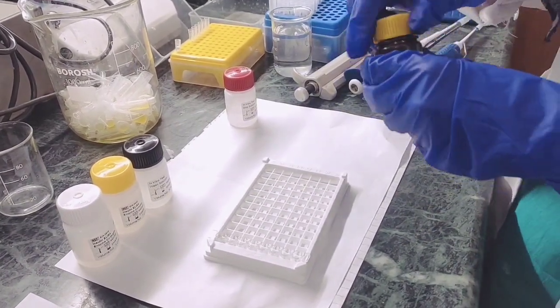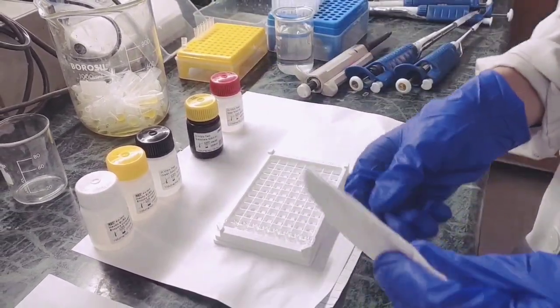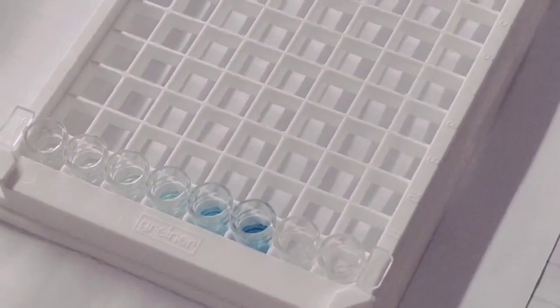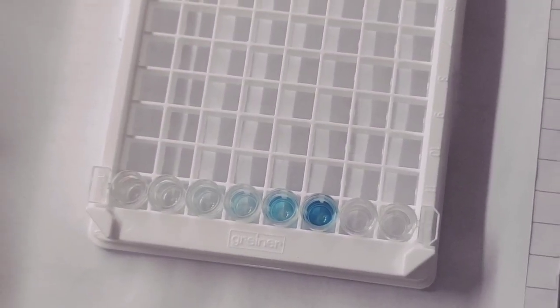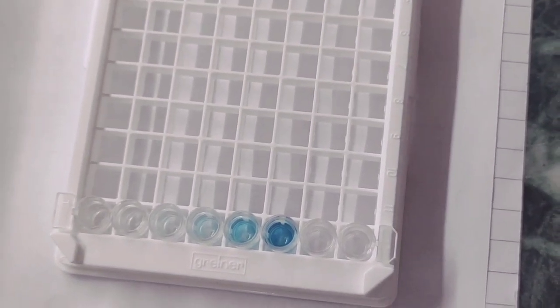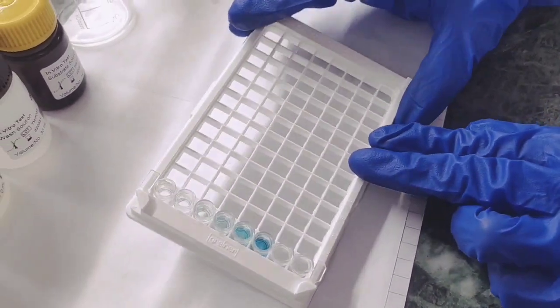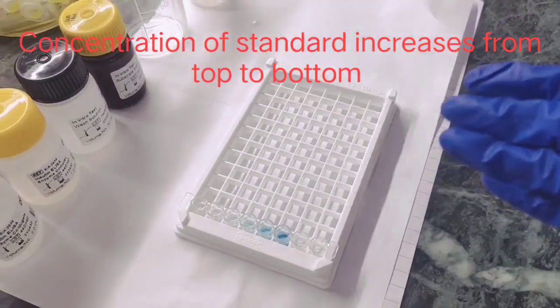Now we cover this plate and incubate it for 15 minutes for the color to generate. We have incubated it for 15 minutes and you can see the color has developed. The color is directly proportional to the concentration of insulin. We have taken 6 standards. From standard 0 to 5 the concentration is increasing, so we can see the color is also getting darker from top to bottom.